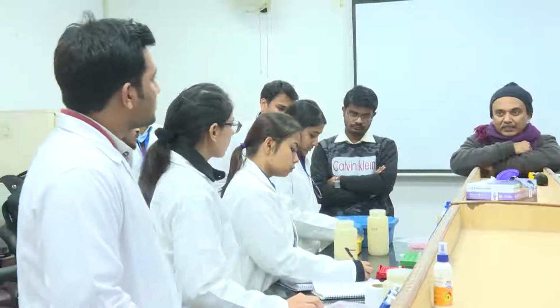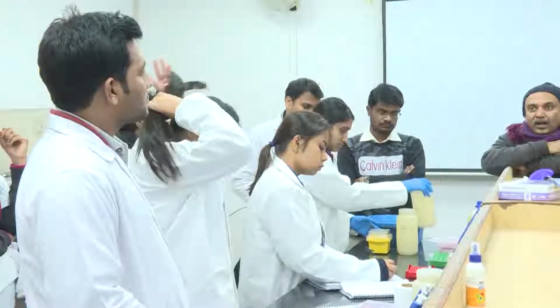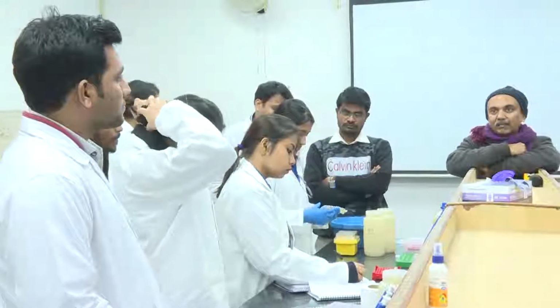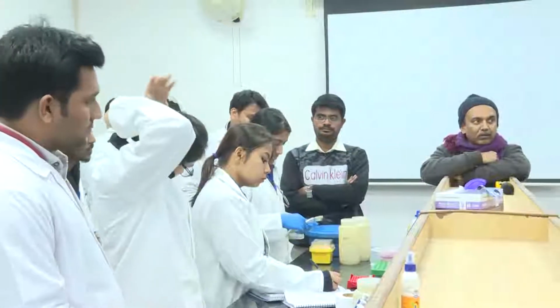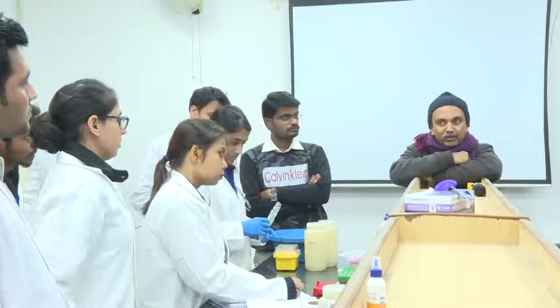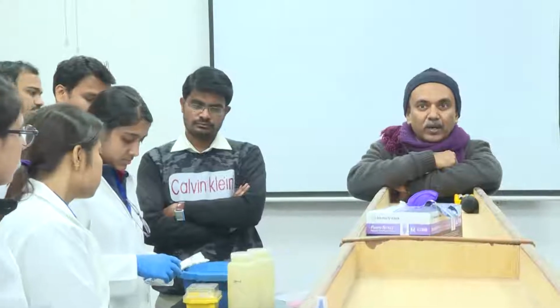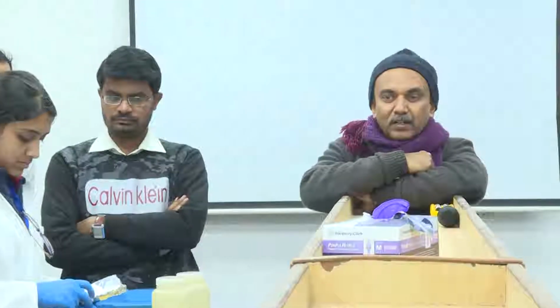But if you are able to extract DNA from an environmental sample, and if you know certain environmental gene markers specific for a particular group of organisms, will it save time for you? So it is easy to quantify. Suppose you are given a sample and you want to quantify, say, 3 or 4 different genera from the same sample, how many samples may you have to handle?